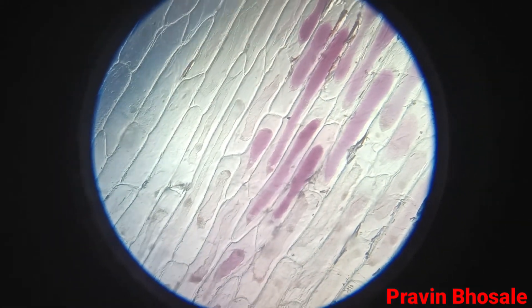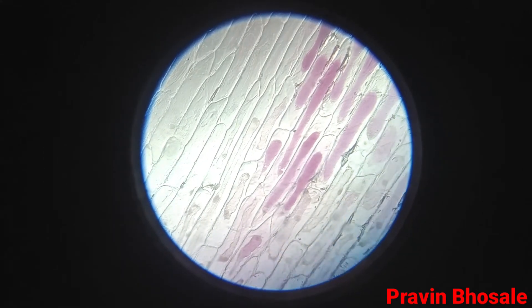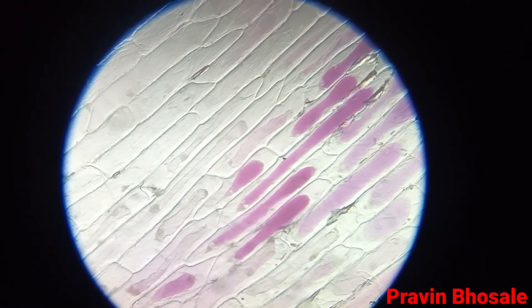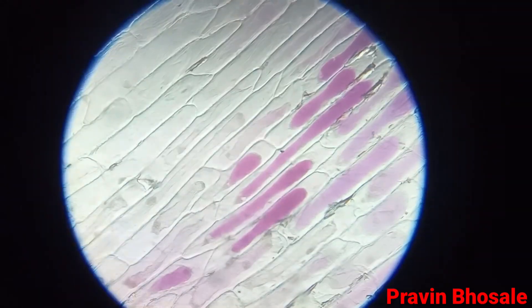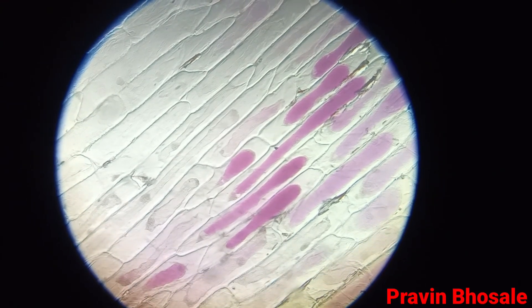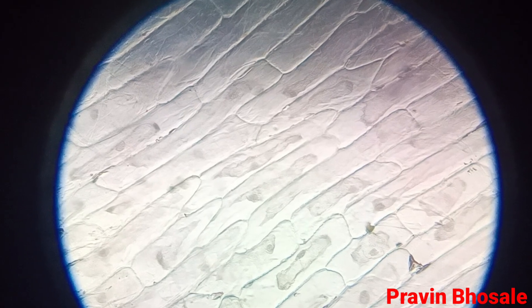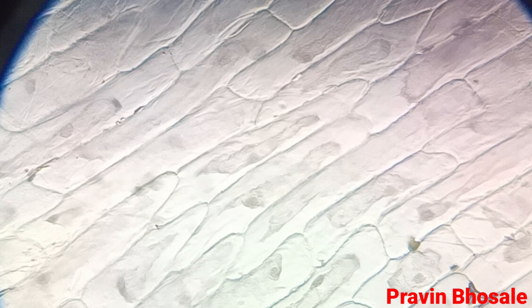Plasmolysis means shrinking of the protoplasm towards the periphery of the cell by losing water. When a cell is kept in hypertonic solution, the cell loses water, the protoplast shrinks away from its cell wall. This shrinkage of the protoplast away from its cell wall when the cell is kept in hypertonic solution is called plasmolysis.